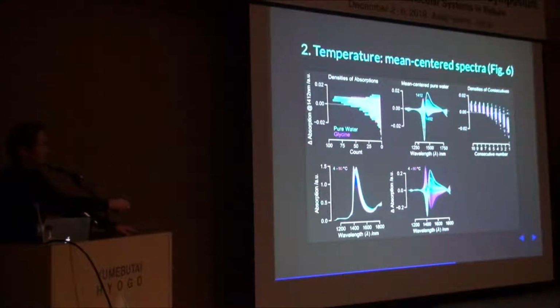There are 1,000 spectra here, and I took this range minus to plus, and I divided it into these little bins. And in each bin, each small range of absorption, I counted how many spectra are there. This is the histogram showing how many spectra we have at each one of these lines. This looks continuous, but no, there is a density maximum that is positioned here.